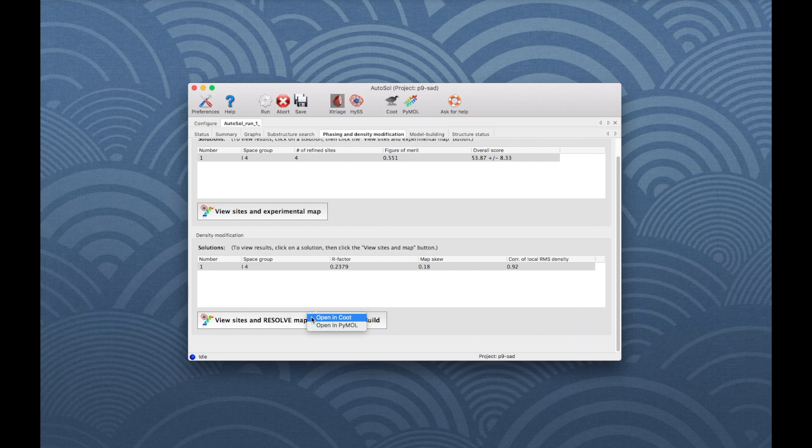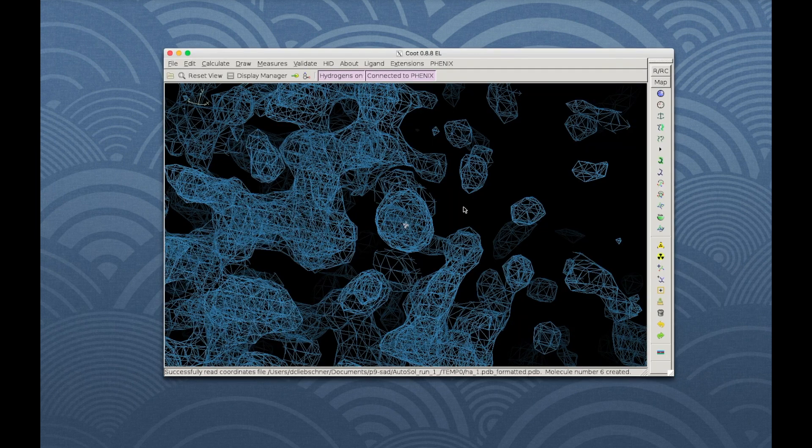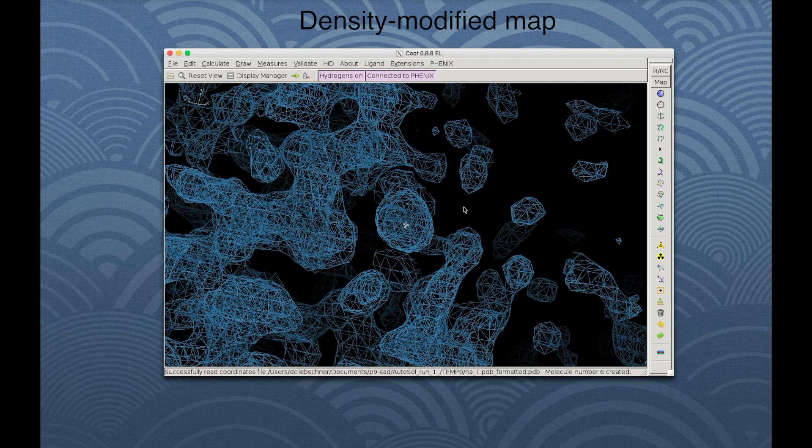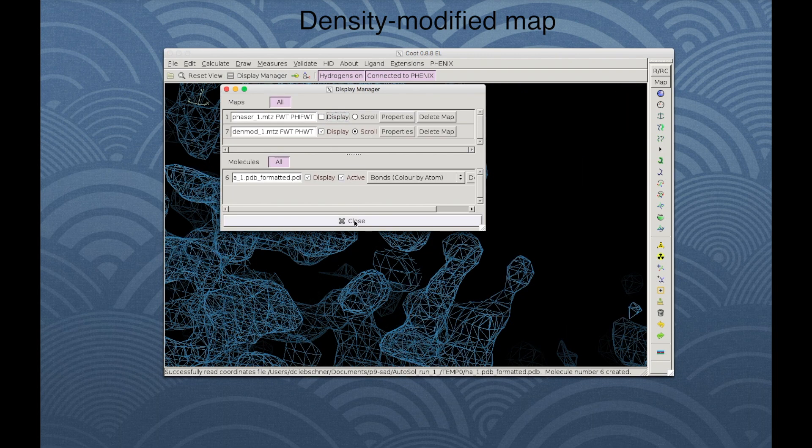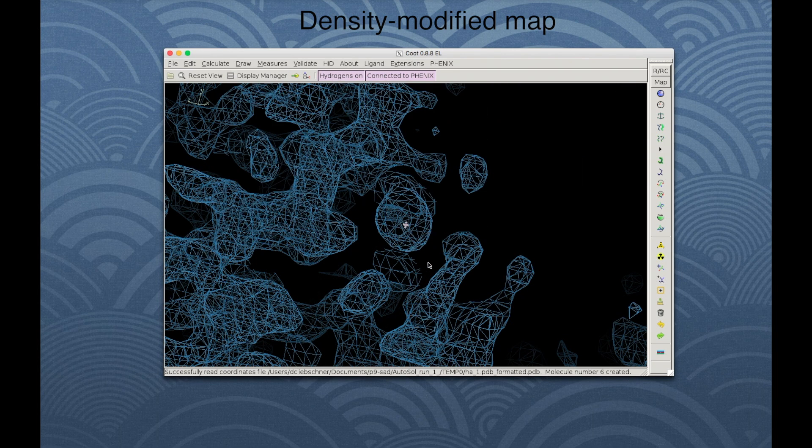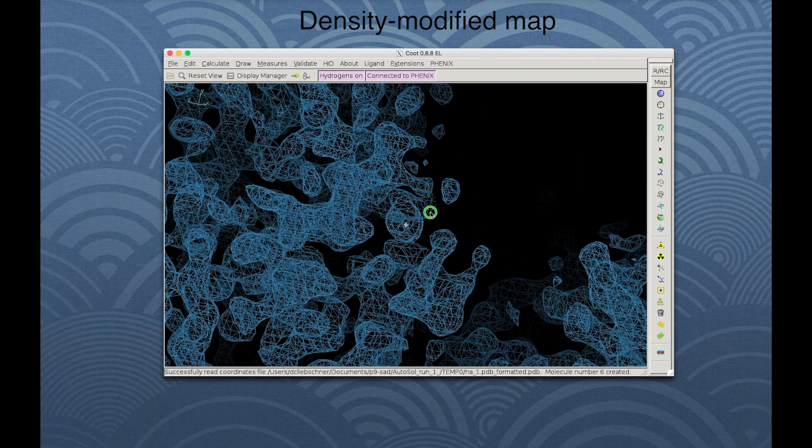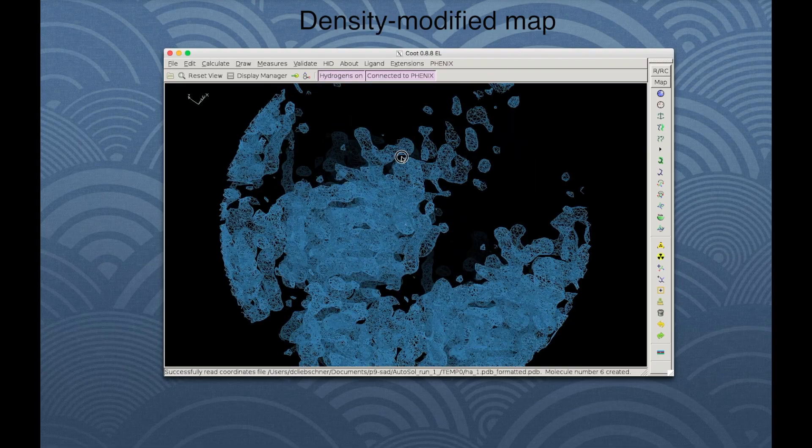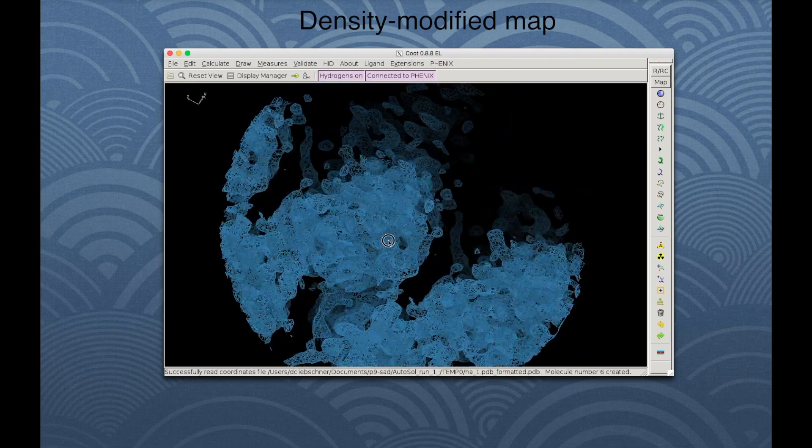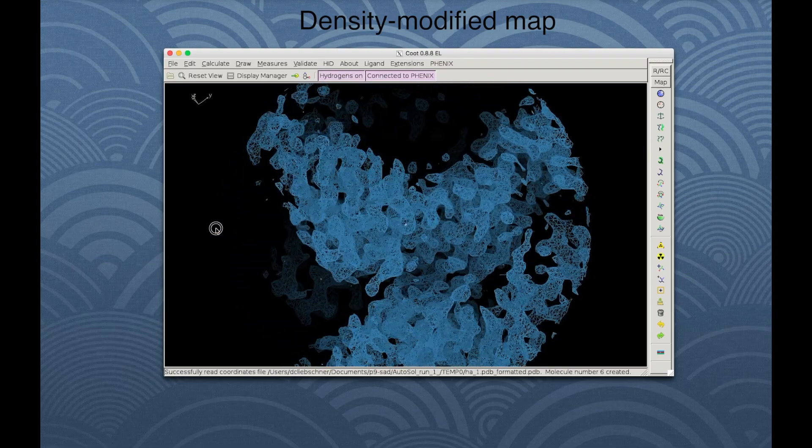Highlight Solution 1 in the lower part. Click on View Sites and Resolve Map and then Open in Coot. The density modified map appears on top of the experimental map in the Coot window. To hide the previous map, click on Display Manager and uncheck Phaser-1.mtz. The density modified map is greatly improved, as the density shows connected volumes for the protein chain.